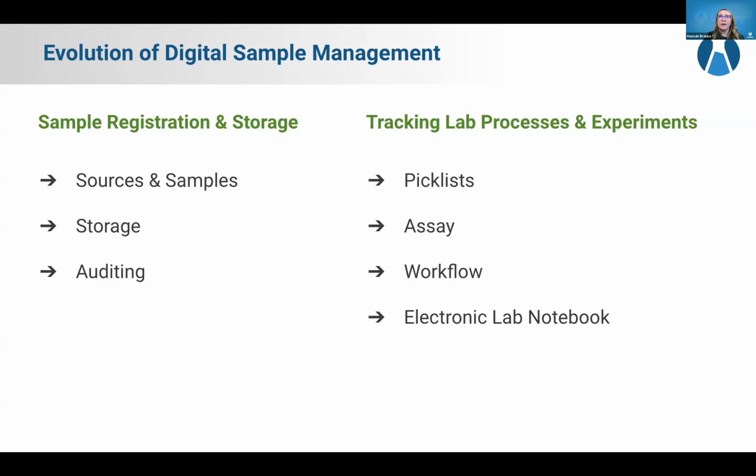One of them, Alex mentioned early on, is pick lists, being able to select samples to ship out or to perform work on or to perform an experiment on, which is a really fundamental concept around experiment management or process management. The assay feature is really designed for the integration of instrument or results data into samples and being able to track those more holistically as well.